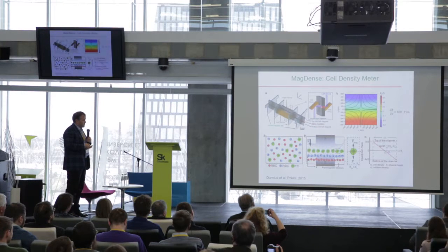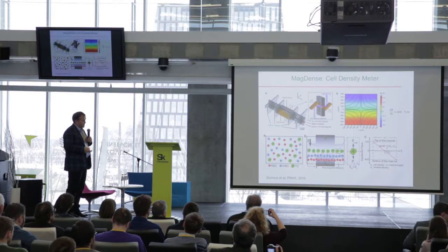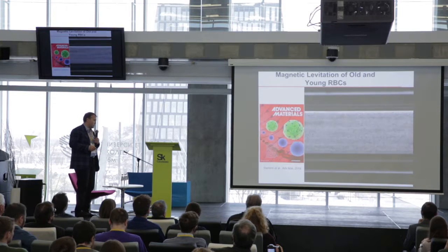And it has very interesting applications in fundamentals of cell biology, cell density characteristics, and what it really means for cancer cells. But one thing that we realized early on is when you take this glass capillary loaded with blood, the red blood cells form one layer, the white blood cells form another layer, and there you might see cells like epithelial cells that shouldn't be there, most of the time being circulating cancer cells.